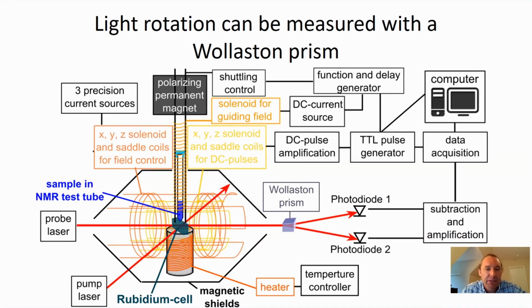So what I'm arguing for, and I think this is something I want to pursue in my lab in the future, is that it probably does make sense to operate with some amount of magnetic field, maybe in the millitesla range, because everything else can be truly tiny and can totally fit on a handheld device. But how to accomplish the shielding of the magnetic fields in a very tiny handheld device is a little bit more challenging. And I'm definitely very happy to discuss all kinds of variants and options here.